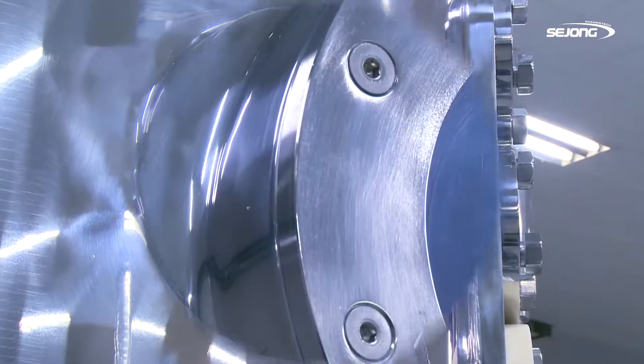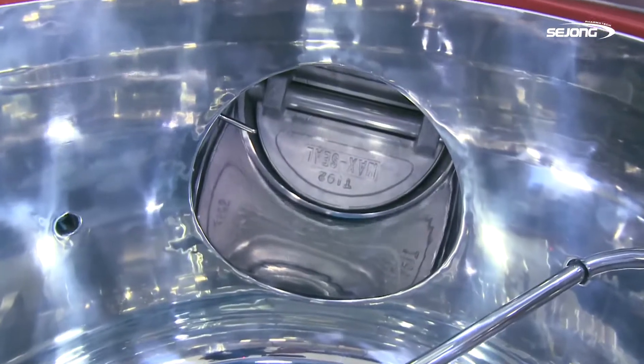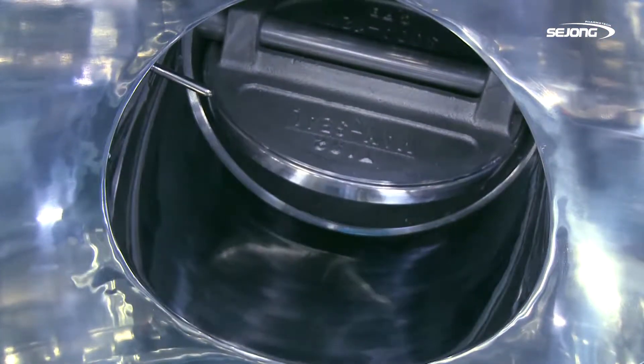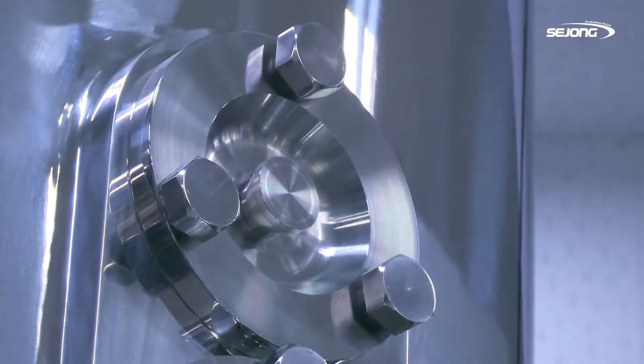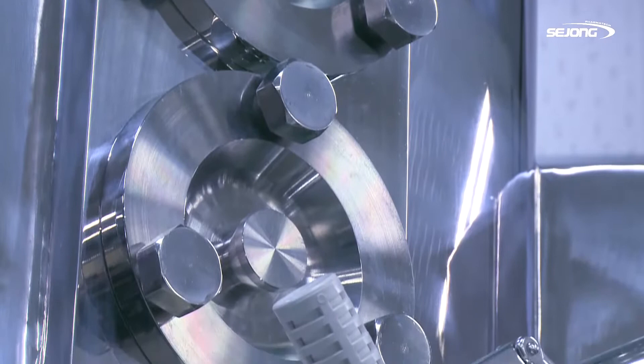The body of D-Series, including every flange, valve, and weld zone, has been designed on the basis of a 12-bar standard 4-pressure container. With the help of a quick-acting valve, it can basically prevent the machine and operator from explosion of dust and organic solvent.